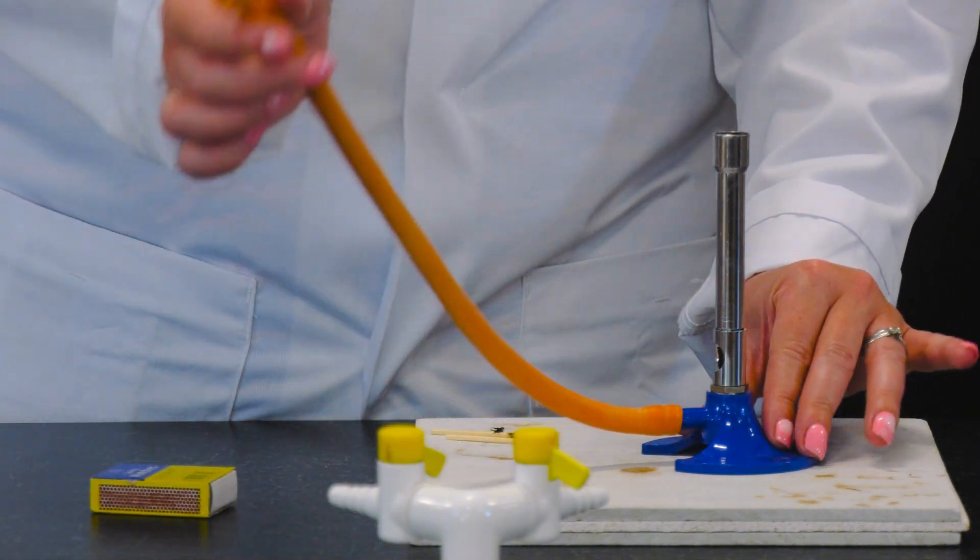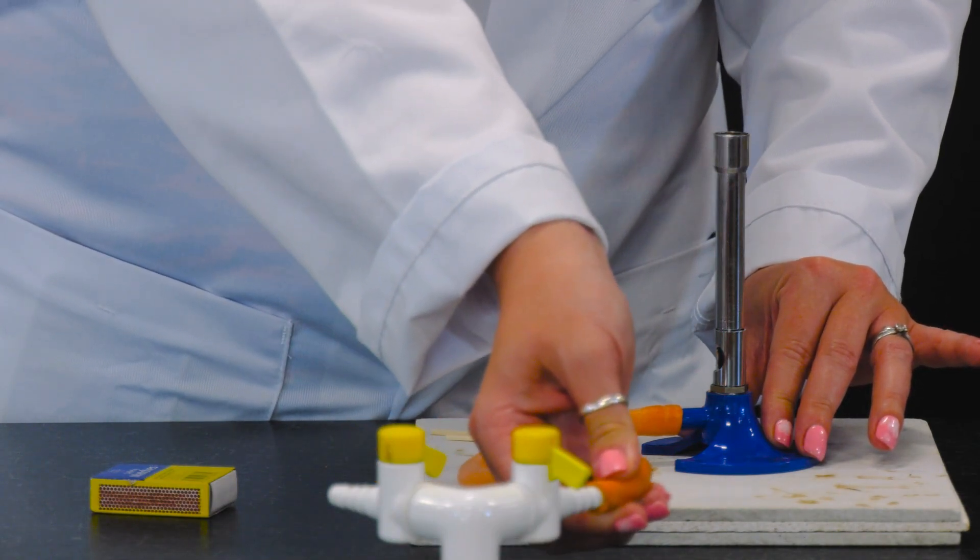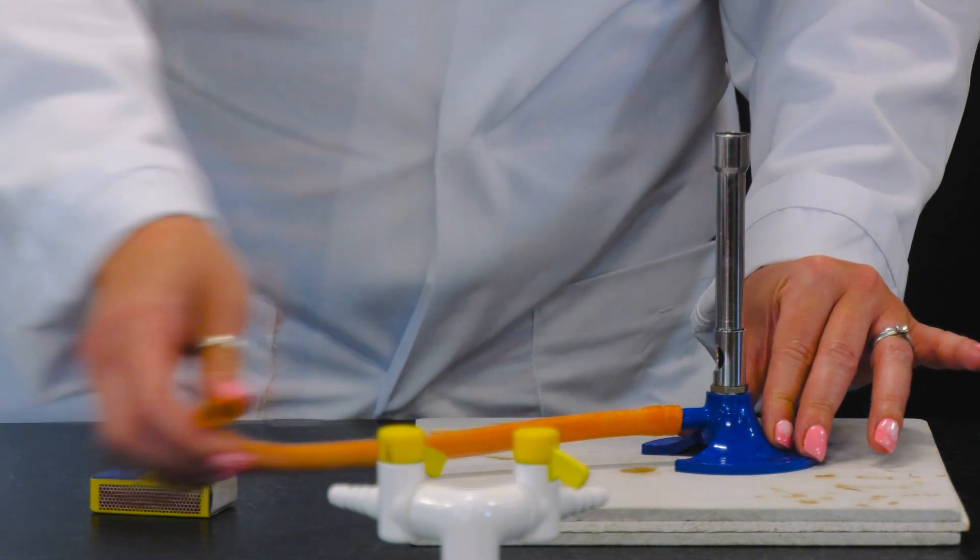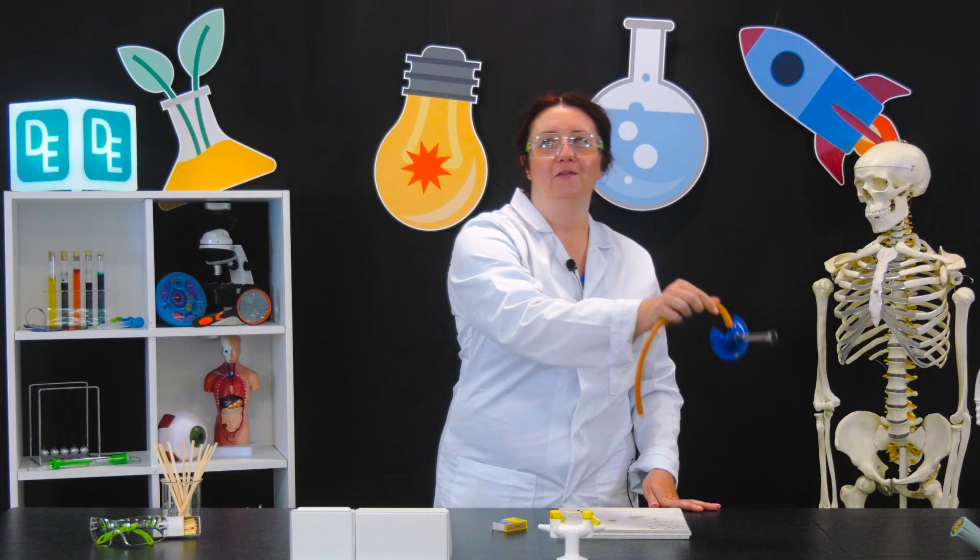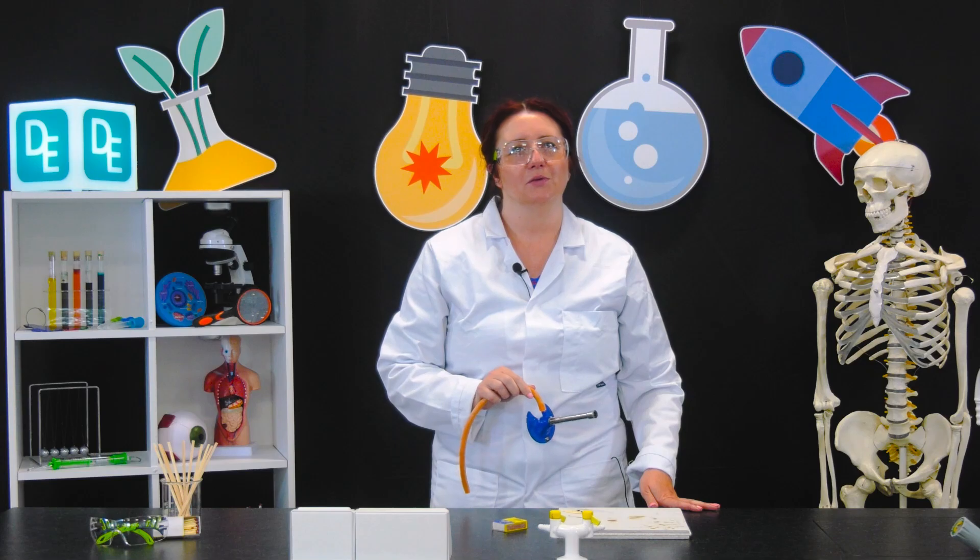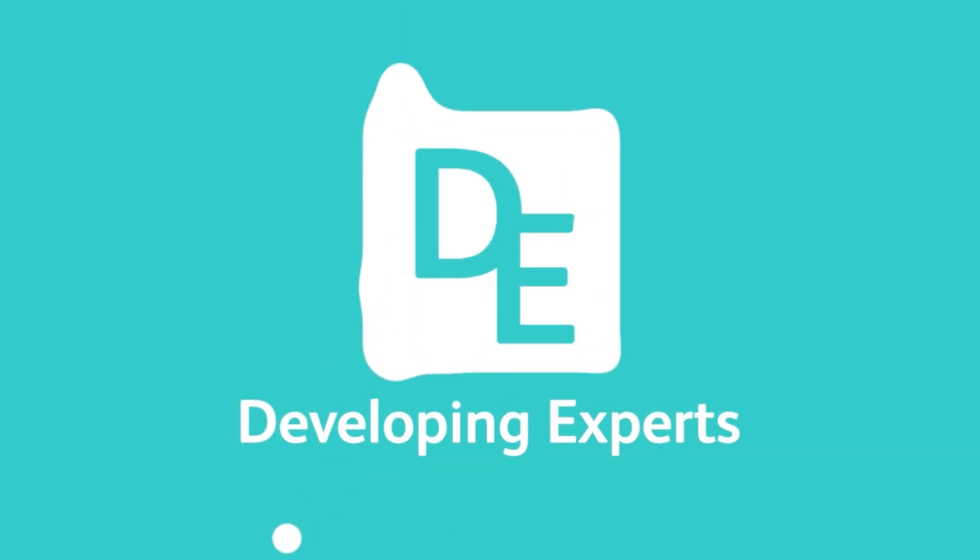Take off the rubber tube from the gas tap. You can hold it by the rubber tubing and put it safely back in the box where you got it from. You'll find inspiring lessons, ideas, and planning at DevelopingExperts.com.